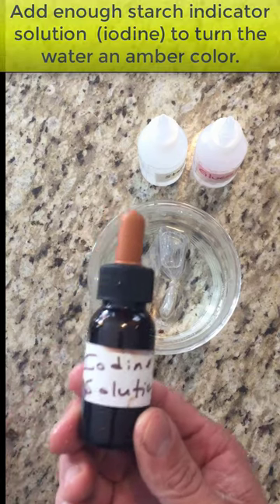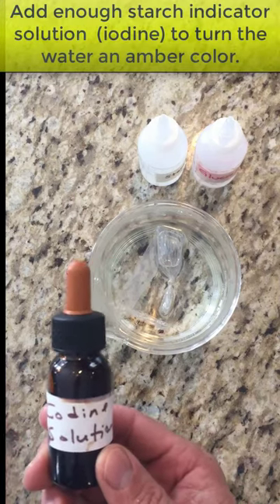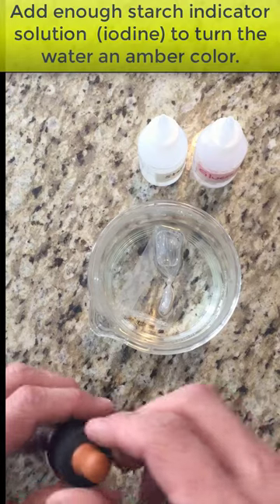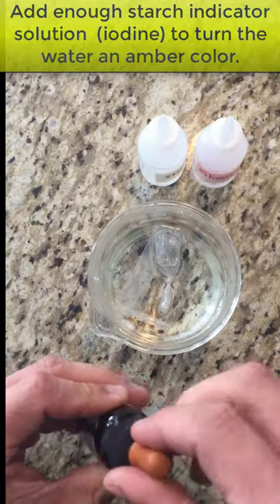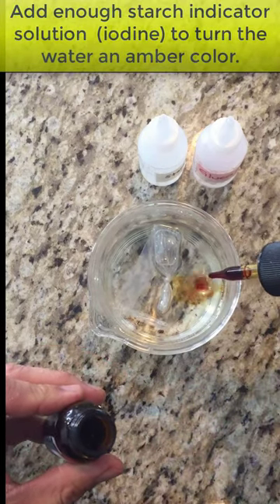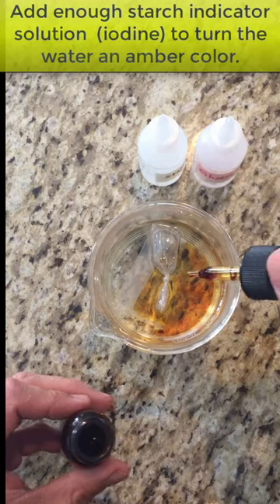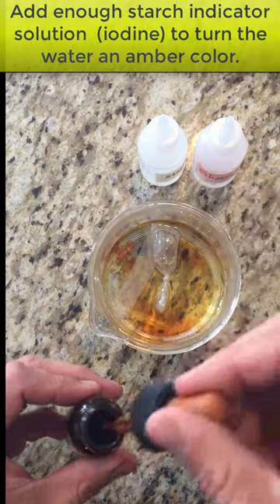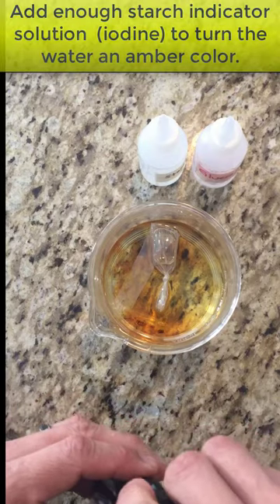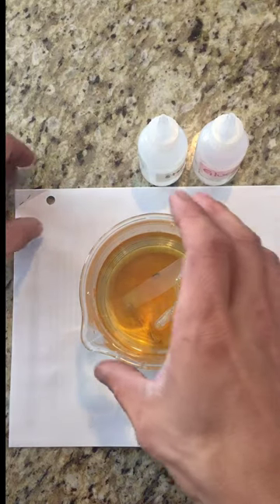Your starch indicator solution is the iodine, the brown bottle. Be careful with the iodine because it is a stain — if it gets on your clothes it can stain or ruin them, and it will stay on your hands for a little bit. Add enough iodine to the beaker to make it turn an amber color, which is that yellowish color. Once you have the amber color in the beaker, you can move on to the rest of the lab.